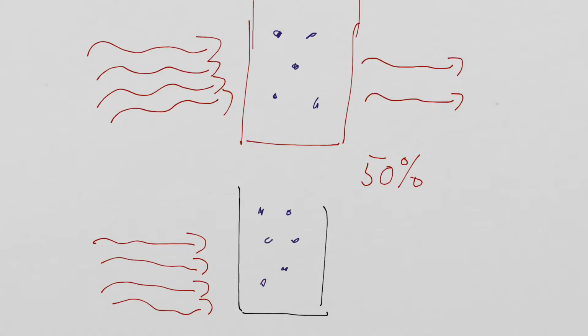I have now doubled the amount of dots in the same volume. Remember, amount per volume is concentration, exactly. So I've doubled my concentration. What would you expect to happen to the amount of light? How many of these light bits should I draw? One? Excellent. Why one? 25%. Exactly. So all but one gets absorbed.